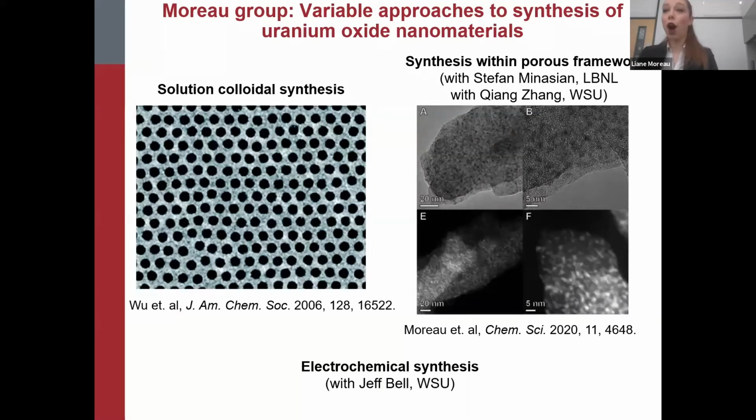I think that the COF method was really powerful. However, covalent organic frameworks are only so large in the pore sizes you can get. Actually, COF-5 is one of the largest that exists. So if we ever wanted to look at the size regime that's between 2 nanometers and bulk, we need another methodology to use. And so that's where we've been looking at different methods.